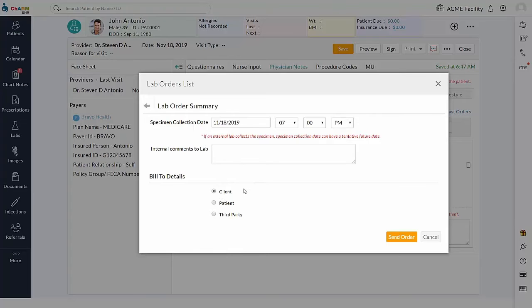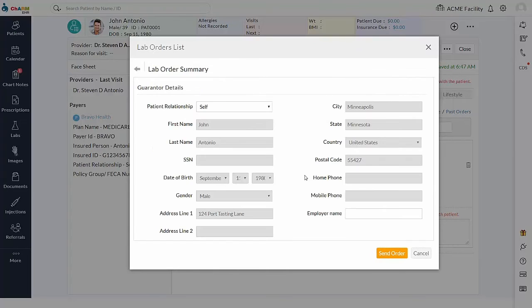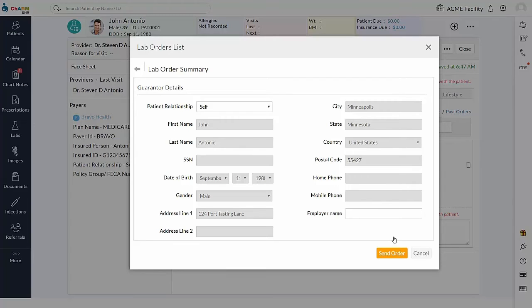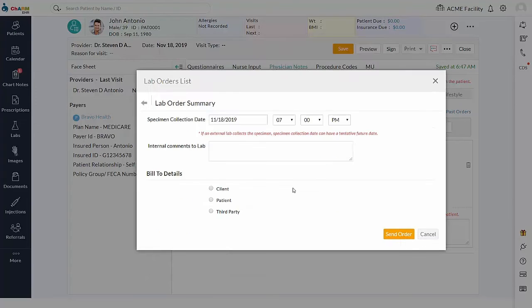If the bill is client, practice is taking responsibility to pay the lab fee. If the bill type is patient, the lab fee will be paid by the patient directly to the laboratory. Guarantor details are mandatory for all the patient and third party billing types. If a guarantor is configured in the patient demographic section, it will automatically be pulled here.